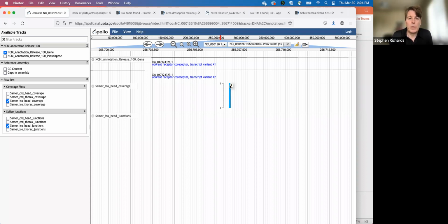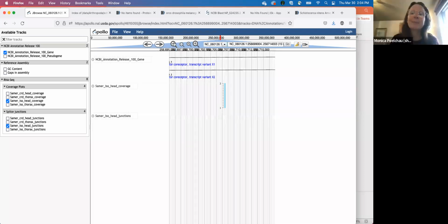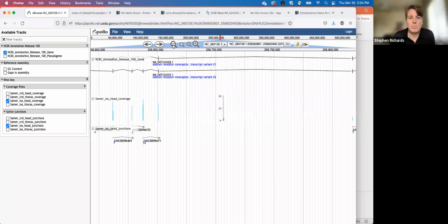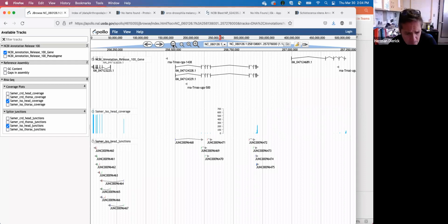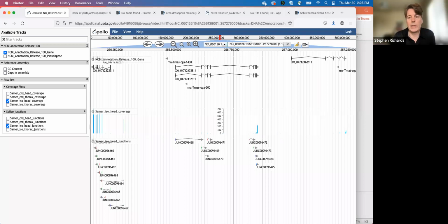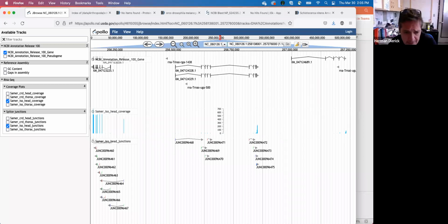So my feeling for everyone is that in general, because the genome is such high quality, the NCBI annotations are probably really good. Yeah. My worry is that some of the genes may be so long that we might be missing the ends of some, simply because it's a megabase long gene or something. But I don't think that will happen, that's my guess. Herman's been looking at a few genes. They are indeed long, right? Huge. But you did find the ends of them okay in the NCBI annotation? Yes.